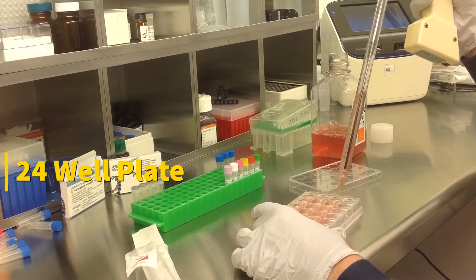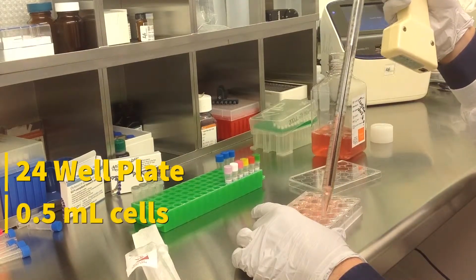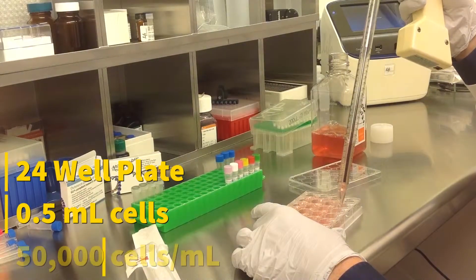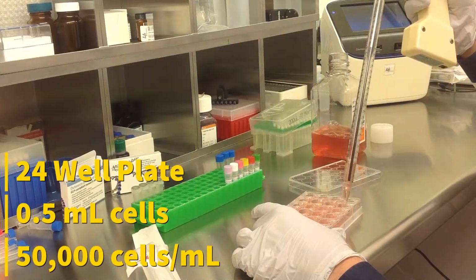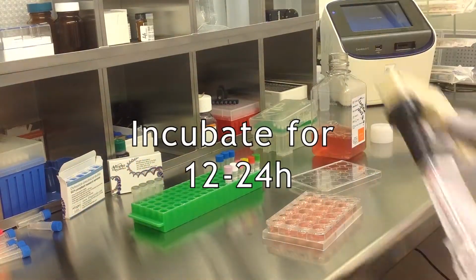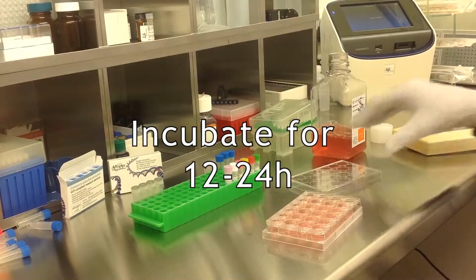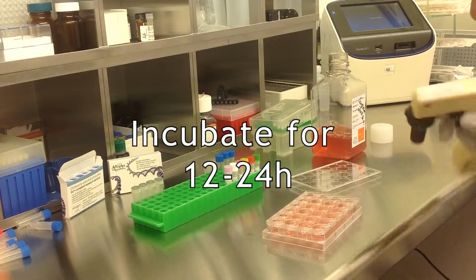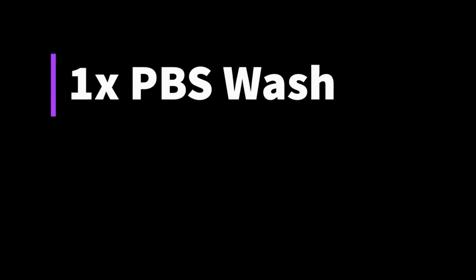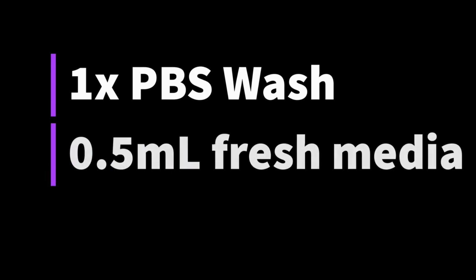Start by seeding 500 microliters of cells in a complete growth medium into the wells. Cell density should be at 50,000 cells per milliliter. Incubate the cells for 12 to 24 hours before transfection at 37 degrees Celsius in a humidified carbon dioxide incubator. When you are ready to transfect, aspirate the growth medium, wash the cells once with PBS, and add 500 microliters of fresh growth medium.